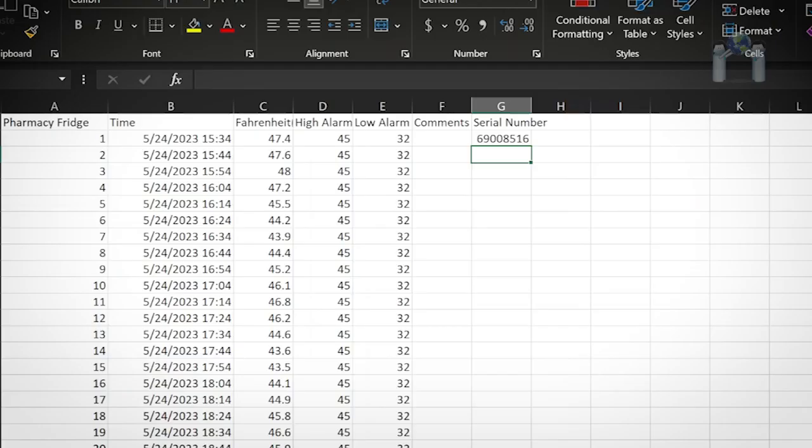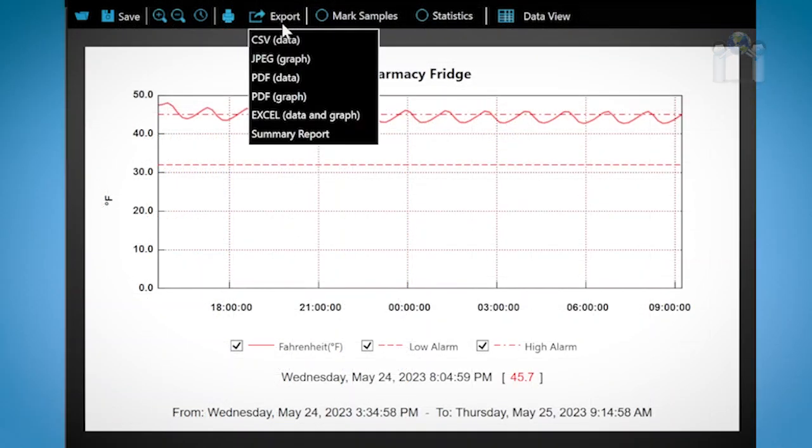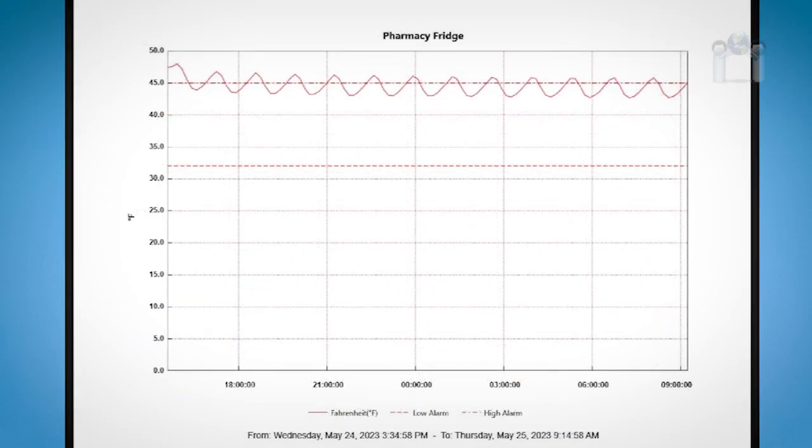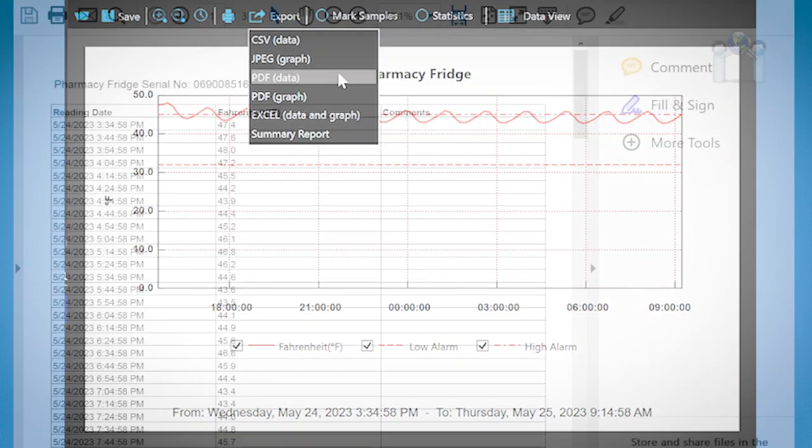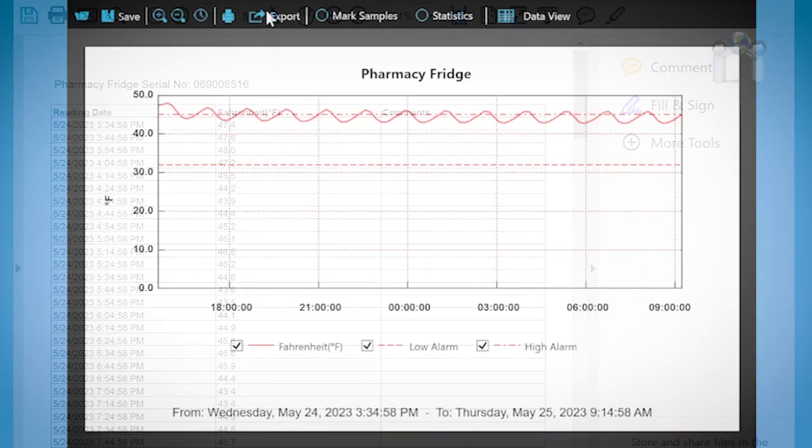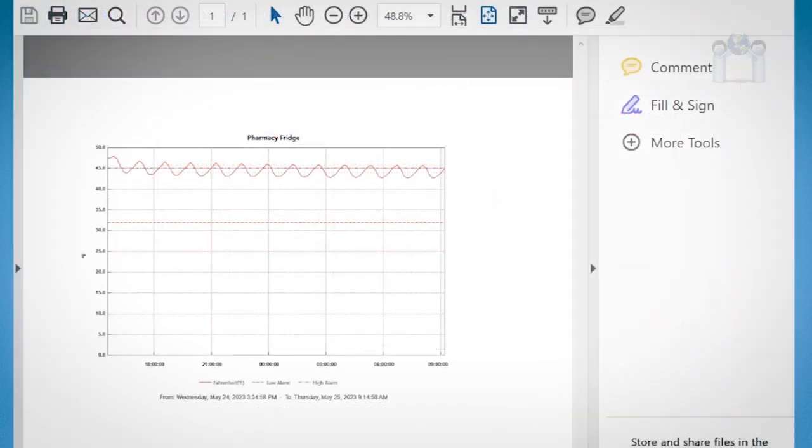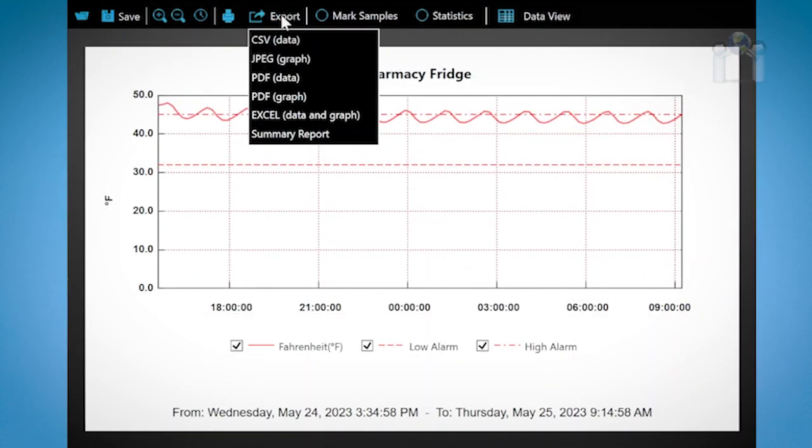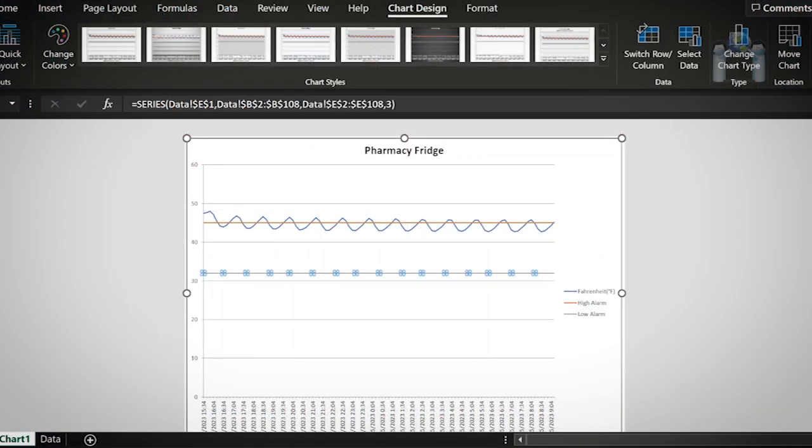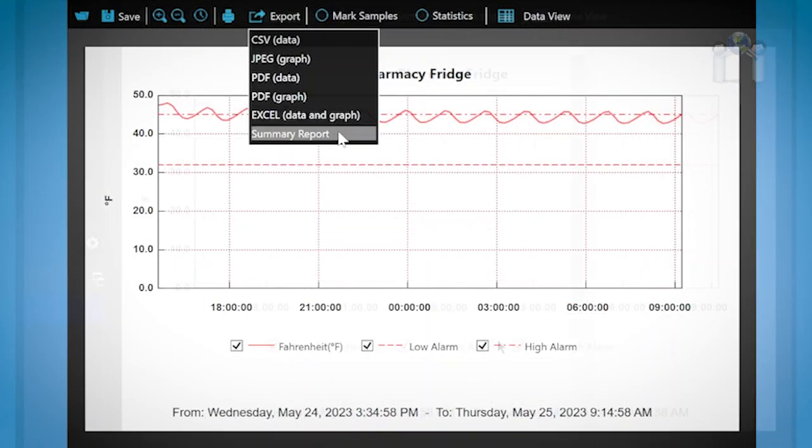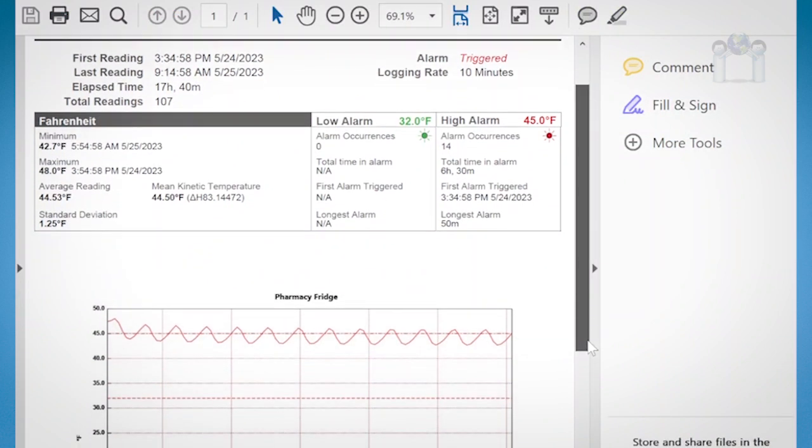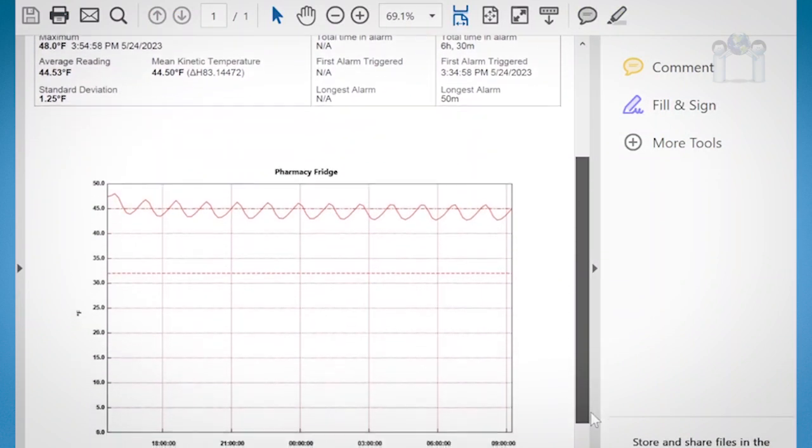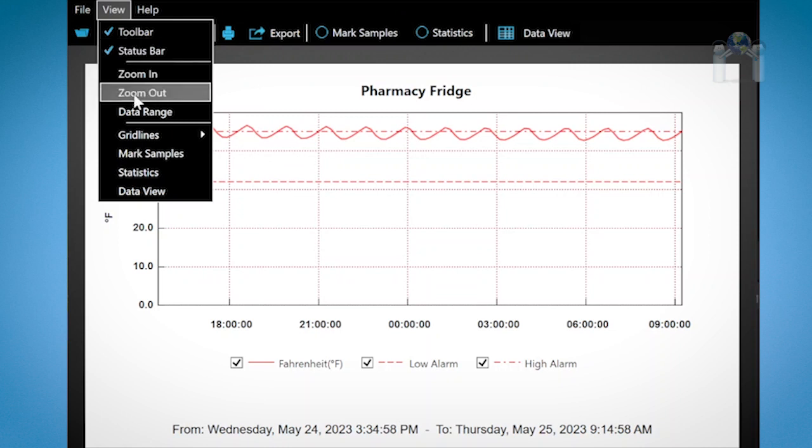Export provides multiple options to output your data and graphs to different formats: CSV data, saving the data in this format will allow you to import it into another application. JPEG graph to save an image of the graph in the common image format. PDF data to save the data in text form in a PDF image format. PDF graph same as JPEG graph but saved in PDF format. Excel format saves both the data and graphic in a format that can be used by Microsoft Excel. The summary report creates a professional looking PDF graph that contains a complete summary report. You can also click on the drop down menu options to make your selection.